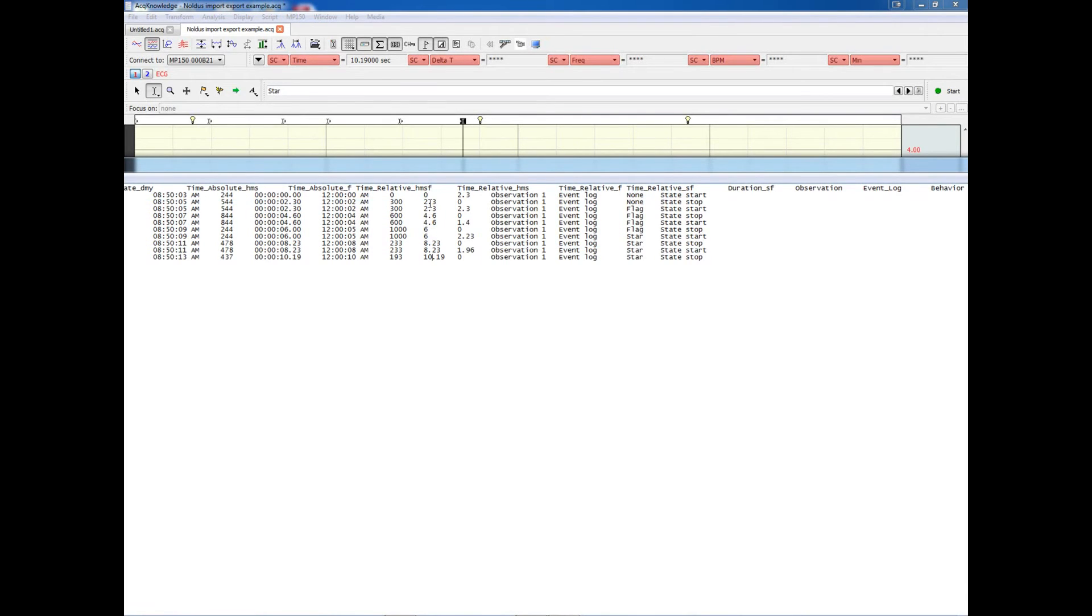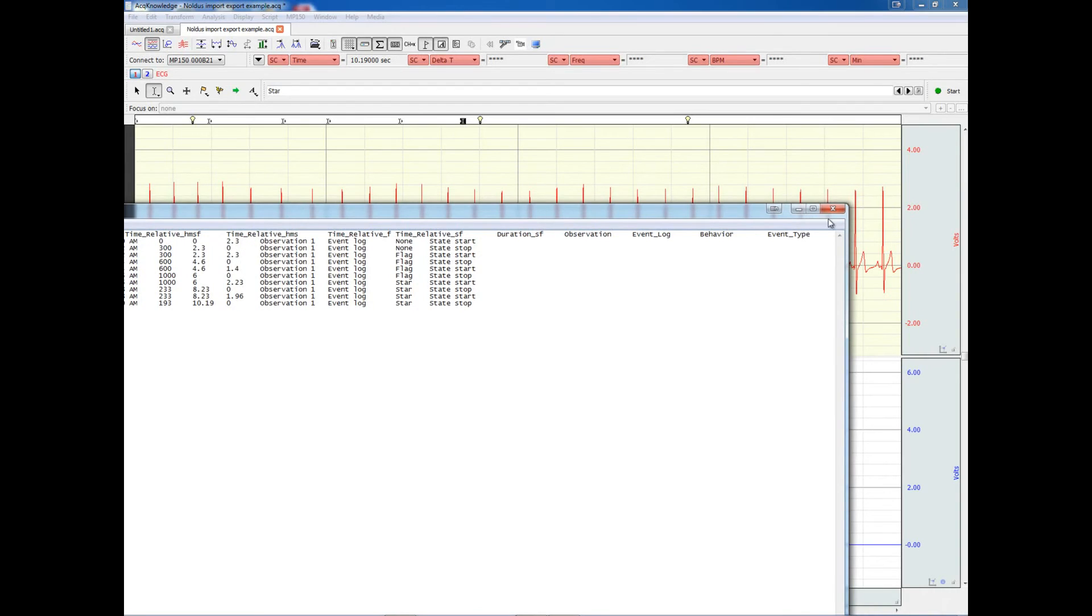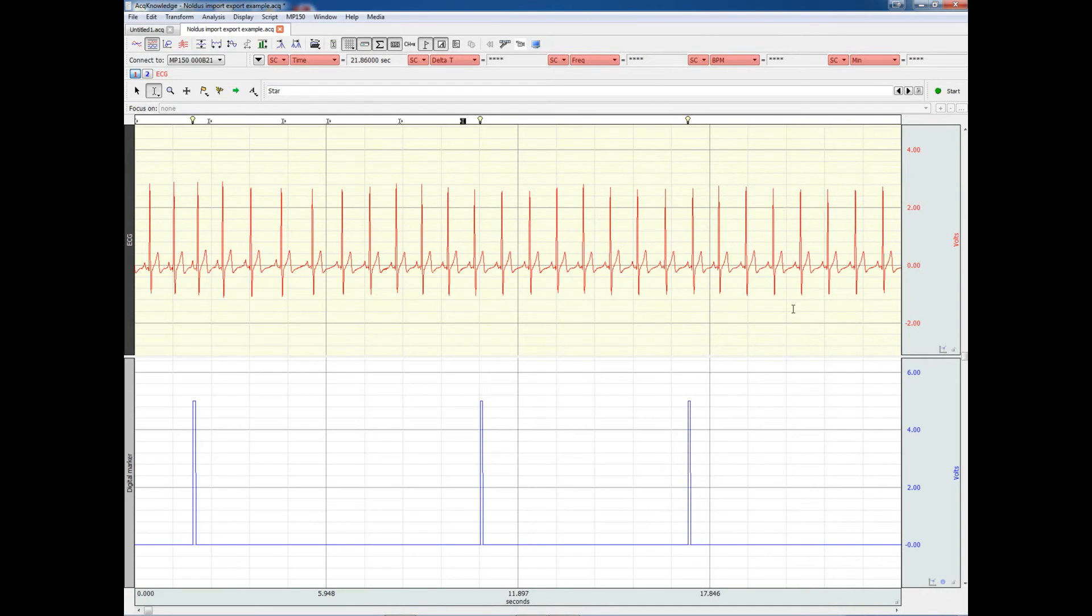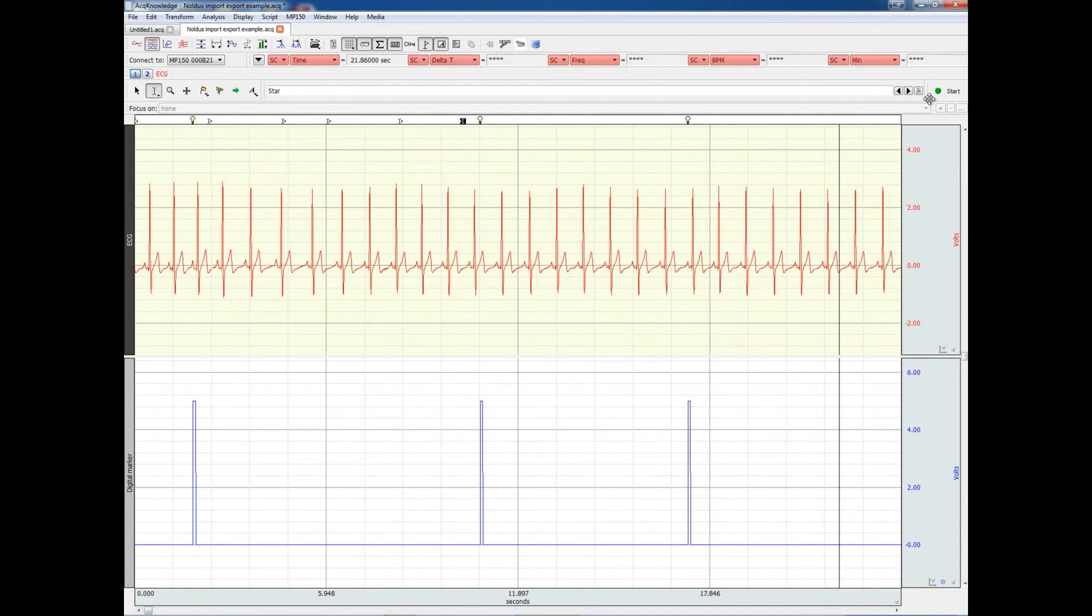As you can see here, it's 0, 2.3, 4.6, or 10.19 seconds. So, for example, at 10.19 seconds, we have a state STOP, and the label is STAR, and that's exactly the event that's highlighted right now.